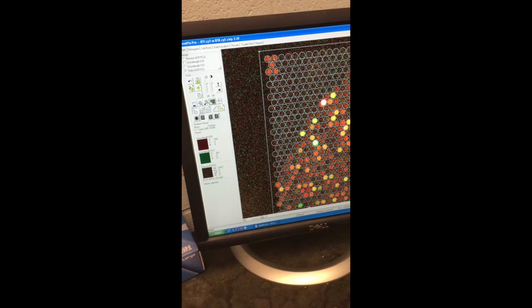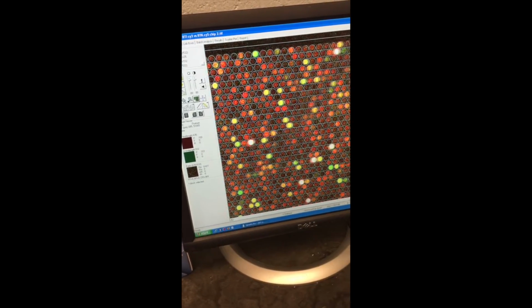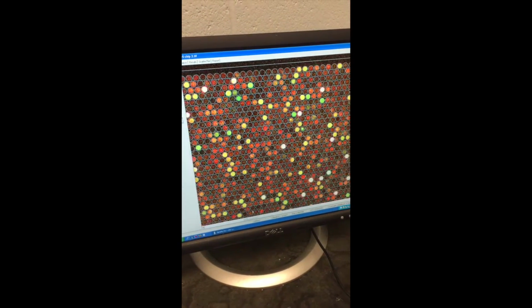But here's the, so this isn't too bad now. See how it's mostly lined up? So I really feel pretty comfortable about this. Now I can tell the computer to find the features. So now it's going to join the map with the images, because the computer can pick up the pixel intensities.